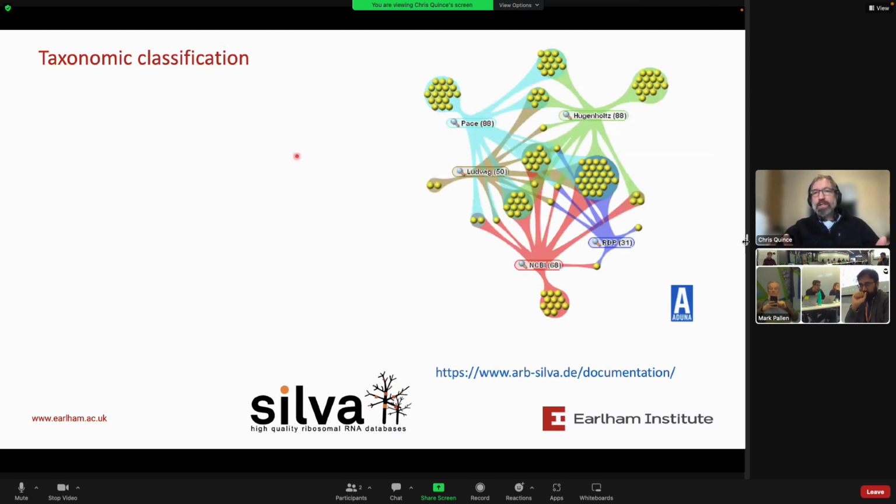All right, so what can we do with 16S? Well, perhaps not that much, all right? Essentially, you can use it to profile the community. And the obvious way to do that is to take your reads and classify them against a database.